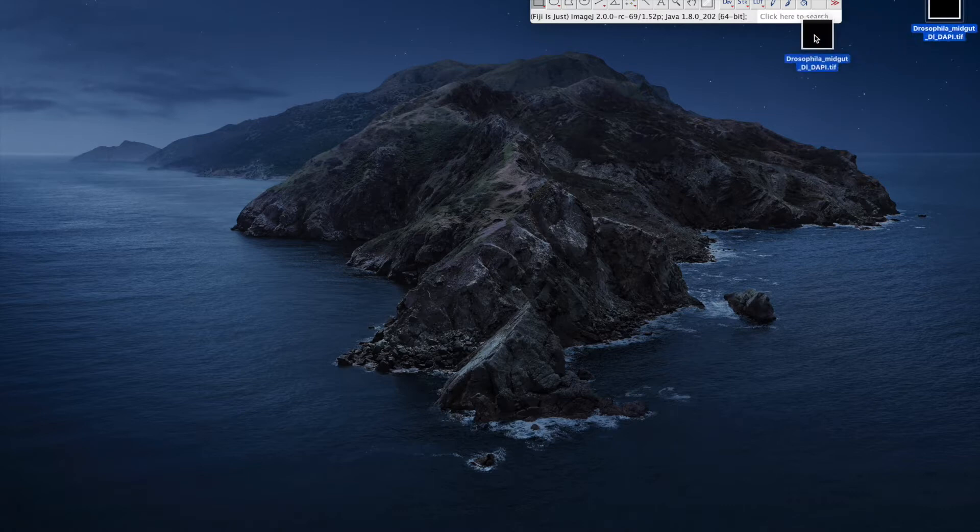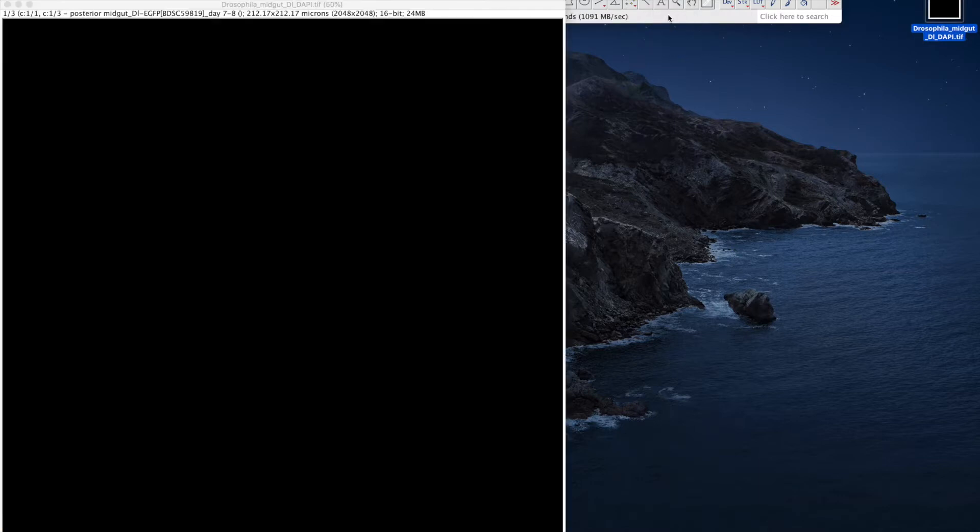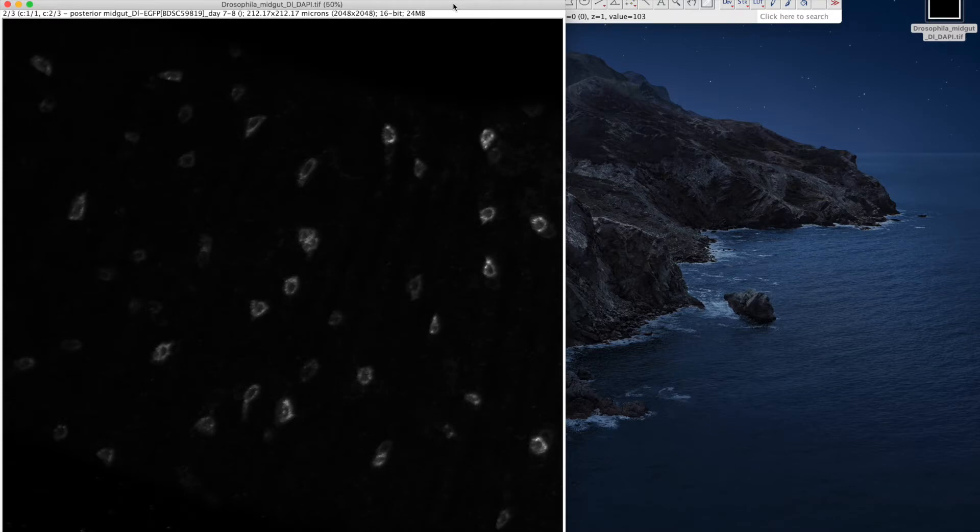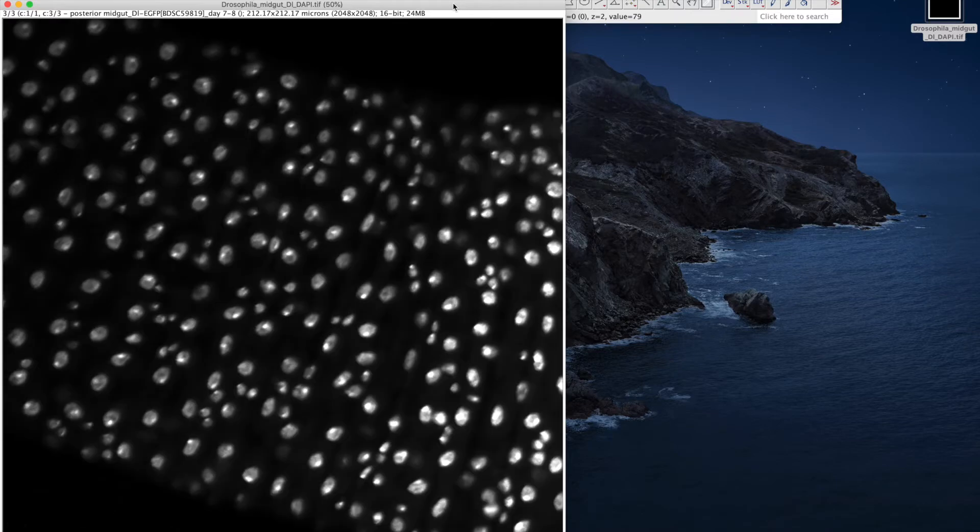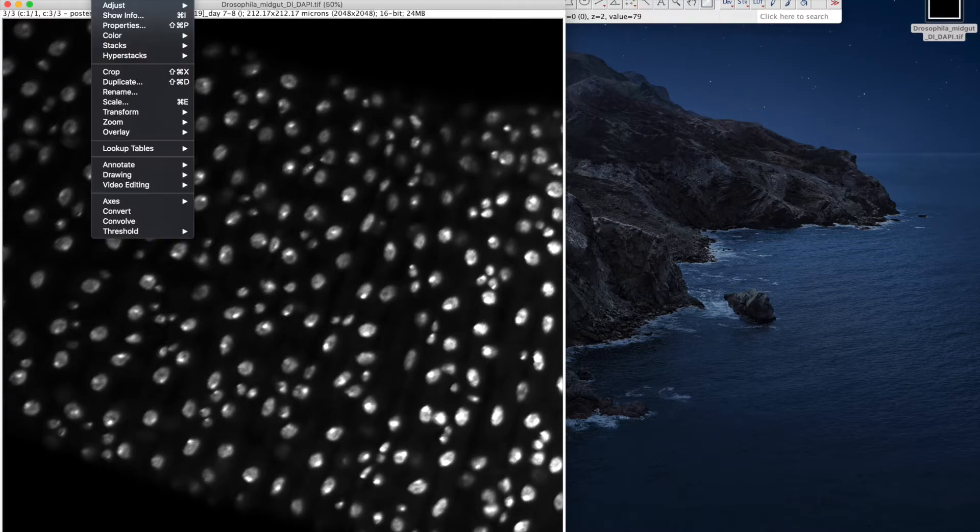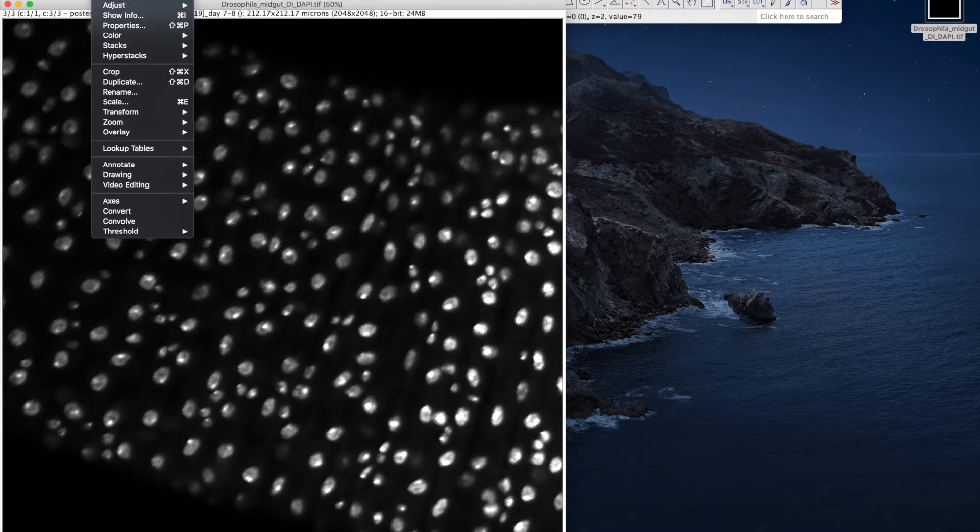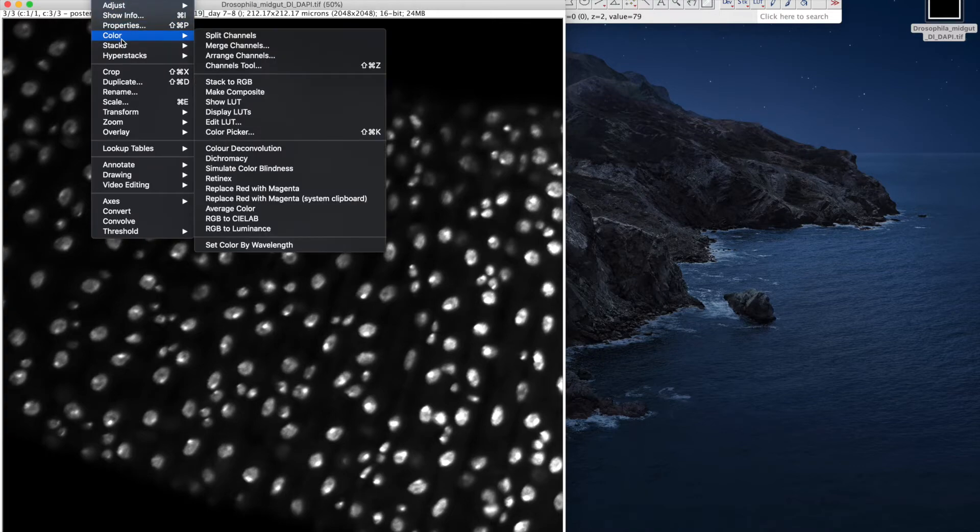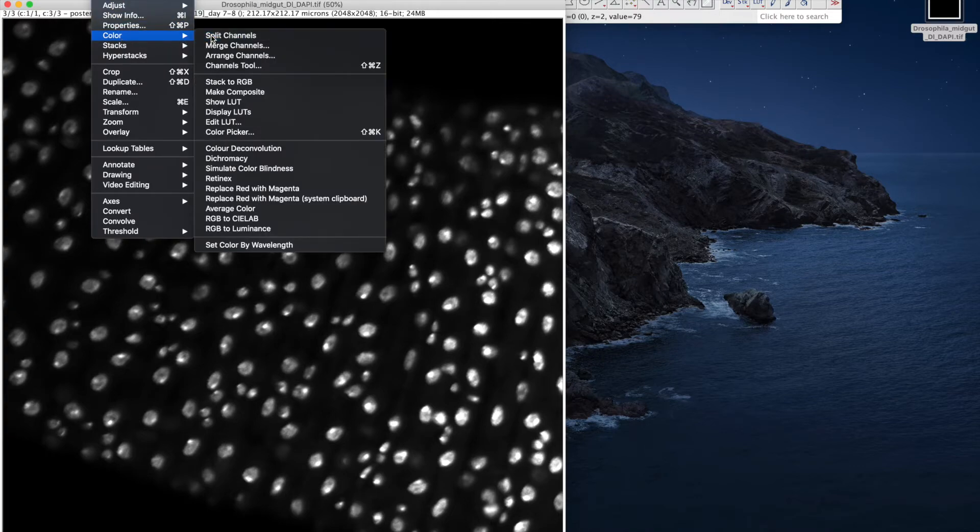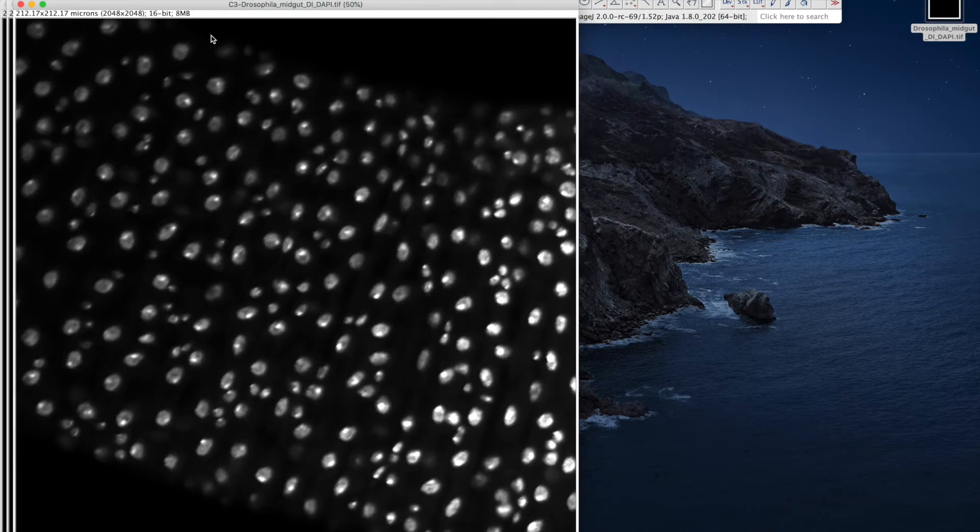First, open an image in Fiji. This is an RGB image and in the blue channel, we can find nuclear staining with DAPI. I will split the image into each channel and close the red and green channel.